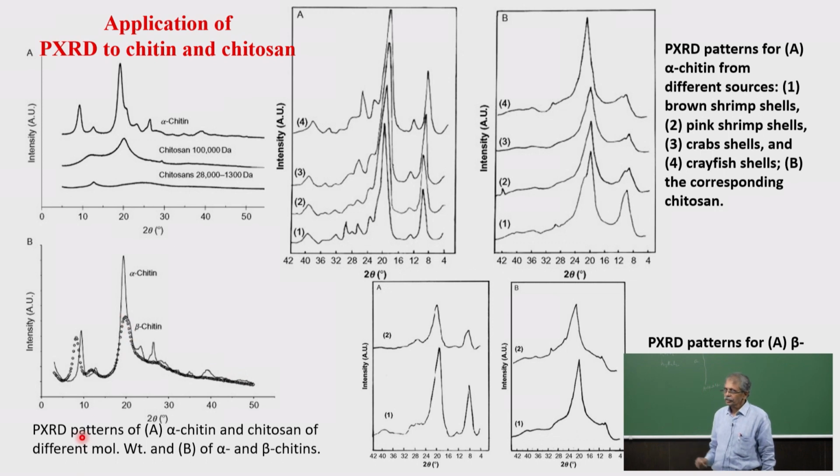There are two types of chitin structures. So you can see that they are there here, and these are all alpha chitin. So you can make out. Now, why are we looking at this? Because these are the materials which you use to make composites. Suppose you wanted to do some kind of drug delivery, with drug nanoparticles embedded into that, or some metal nanoparticles embedded into that to study electronic or magnetic property. So you can use it as a matrix, you can use it to make the composites.